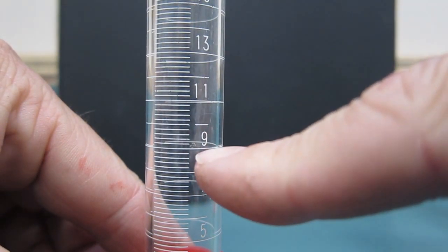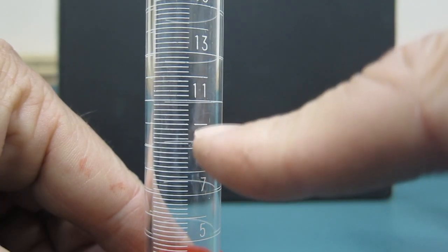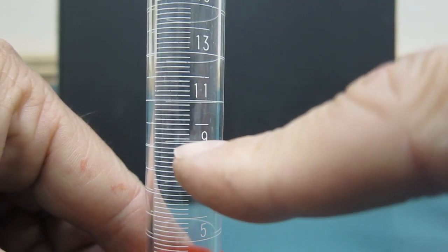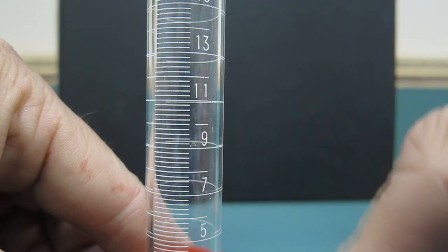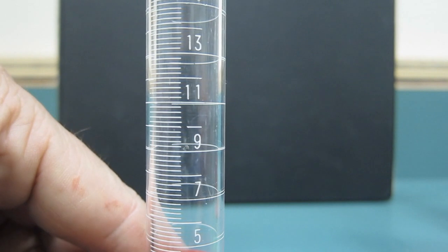Oh, actually, no, that's not true. Nine and 11 is a difference of two divided by ten tick marks here. I'd be counting by 0.2s. But the more lines between here, typically the more accurate.